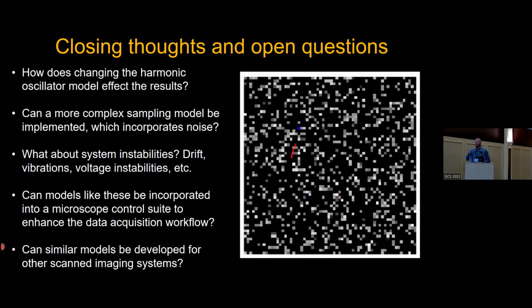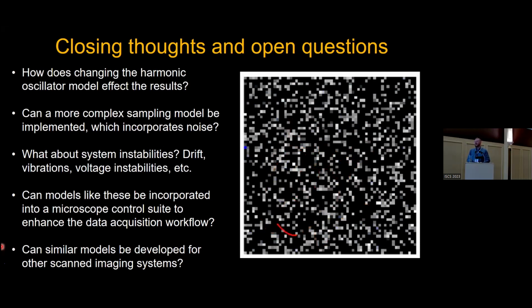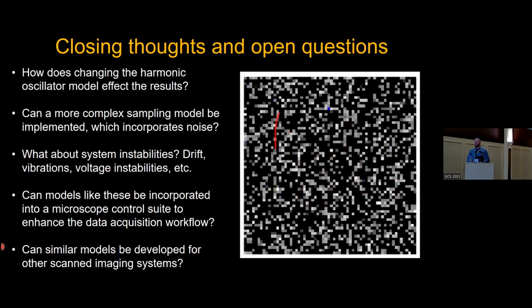None of the hardware has changed since the 70s either. They have been using this since STEM was made, and they've had no reason to iterate because it's done the job. We're getting picometer resolution. I think the world record is 30 picometers, atomic distances being resolved, which is incredible. But that only works in a very specific set of circumstances. When we're talking about subsampling, we're looking at something a lot more flexible, and our microscope needs to be able to handle that flexibility. So that's the way that we're moving.